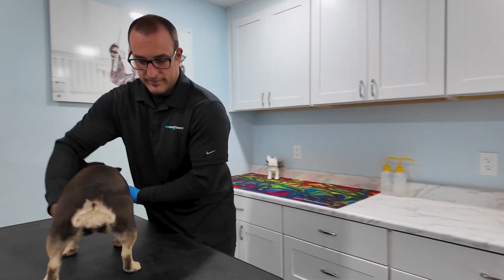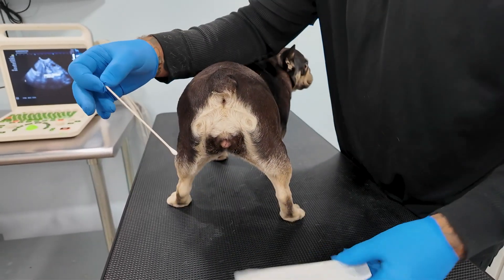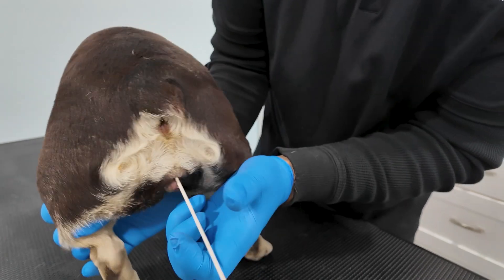Now I'm going to show you how to collect vaginal cells from the dog using a collection swab. Using a sterile swab, I gently insert it into the dog's vagina. Once inside, I twist the swab three times to collect the cells that we need.